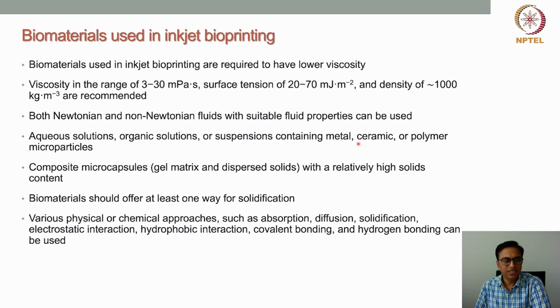But when we talk about inkjet 3D printing, what happens? Because of the nature of the process, during printing, while inside the nozzle, the material should be in the solution or liquid state.